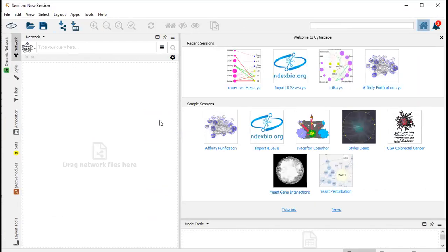This software is free, and you can download it and find much information or many guide tutorials on YouTube or also on the website.